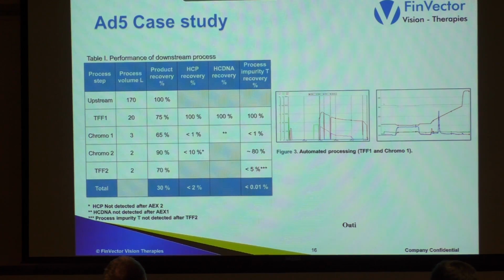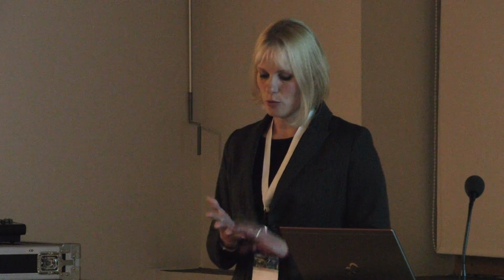But the second take-home message I want before I let you go for lunch is the analytics. One very important perspective of everything the process development team is doing is analytics. Are our analytical assays good enough? Do they give us an answer? What do we need to know to understand the process? Do we have a potency assay that tells us, if we start phase 1, we do some modification, phase 2, we are upscaling, phase 3, is the product safe? Is it comparable? Potency, expression, infectivity, empty particles, those we need to know in addition to all the impurities.